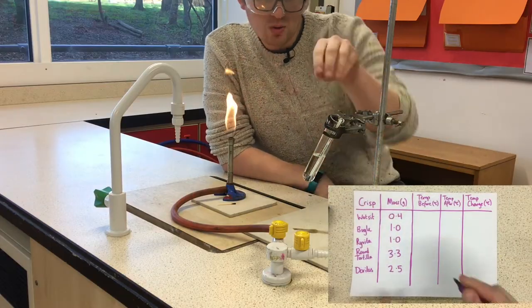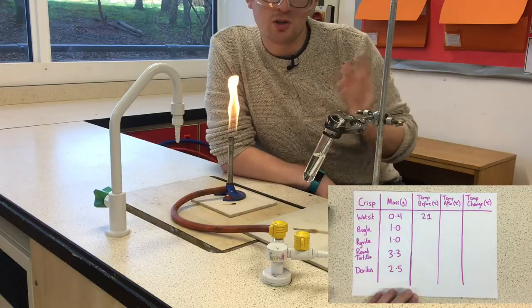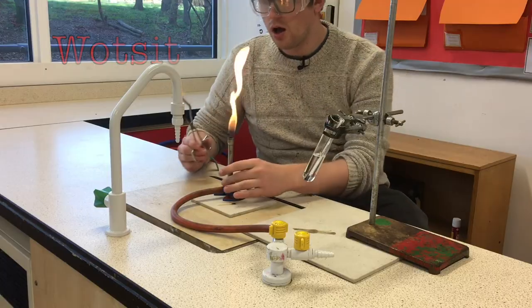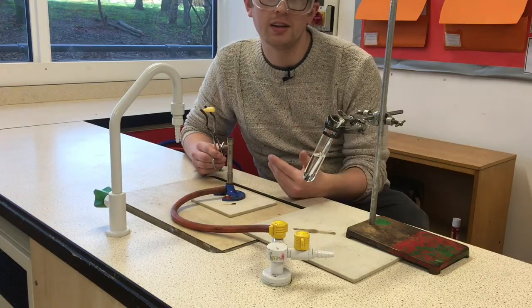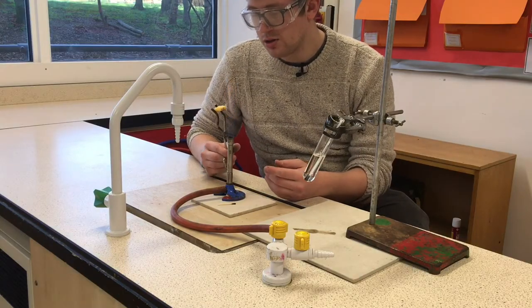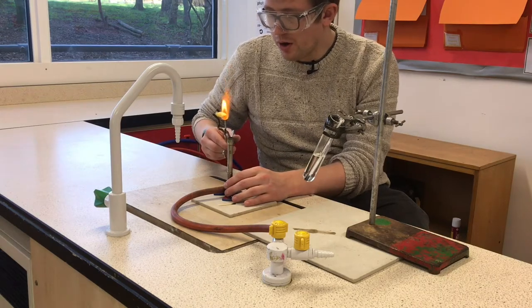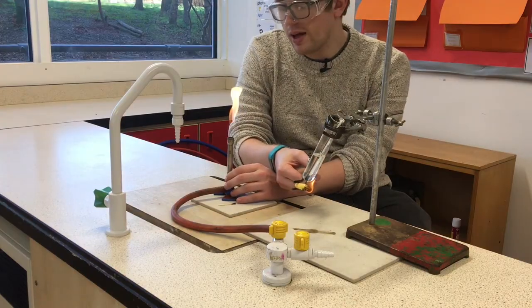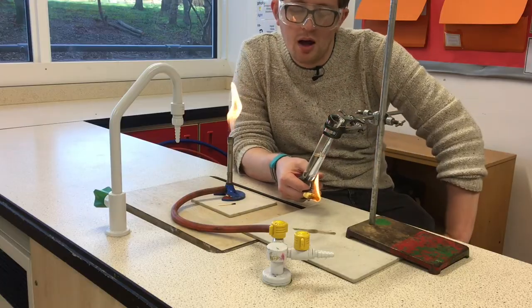I can see it's about 20 or 21 degrees, so I'm going to write that down in my results table. I've then got my crisp in the tongs. I'm going to turn it to a roaring blue flame, light the crisp, hold it underneath, and see how much heat we can get. I'll hold it there just until it's on fire — I don't want to hold it over the flame longer than needed and waste heat energy that could be going into the water.